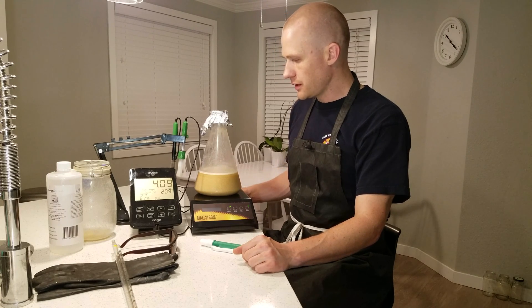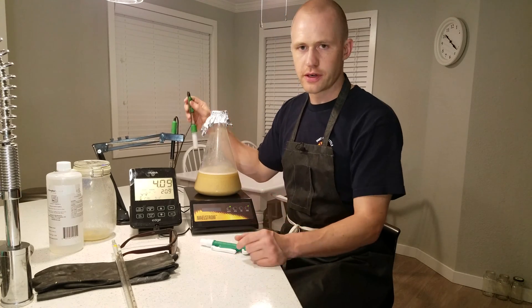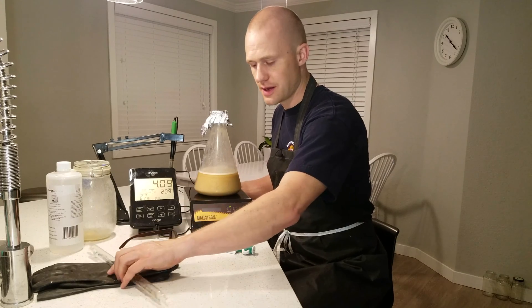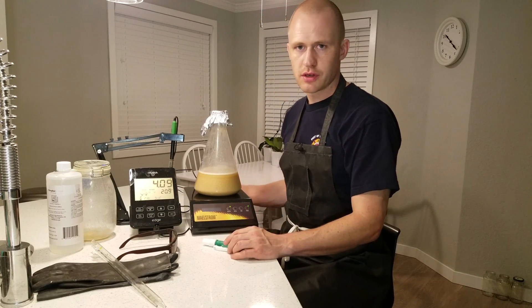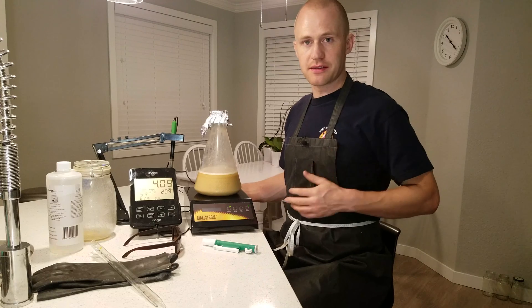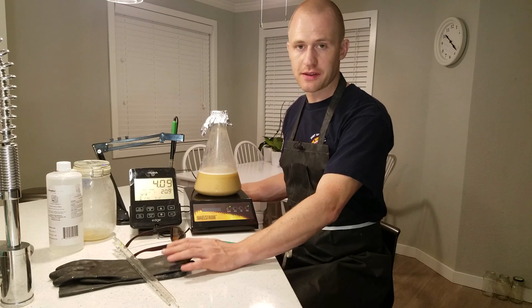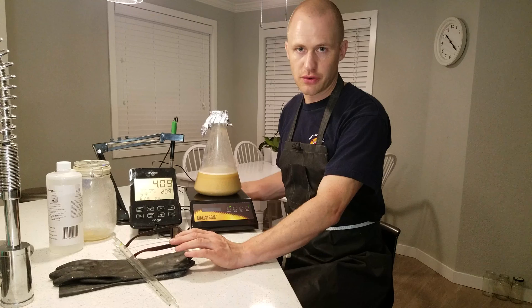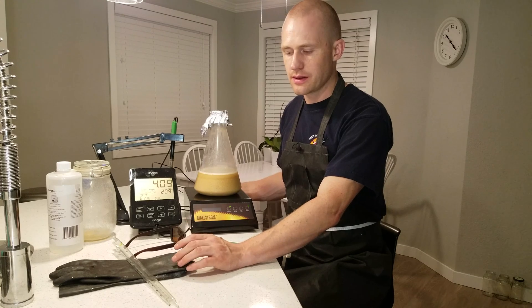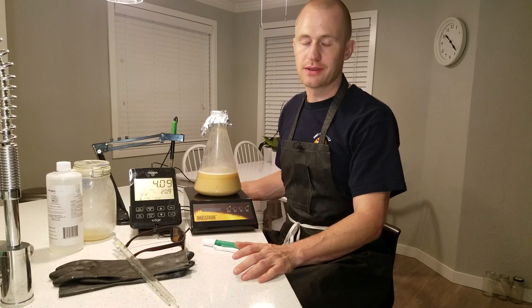What we will now do is use a pH meter to get the pH of this yeast slurry down to 2. To do that we're going to be using phosphoric acid, pipettes, and a pipette pump. What's super important also is to use protective equipment — safety glasses, an acid-resistant apron, and acid-resistant gloves. When we're dealing with phosphoric acid at 88%, you don't mess around — you definitely use the PPE.